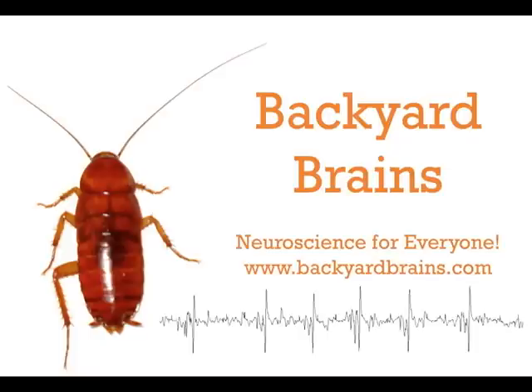Noise — the bane of many a neurophysiologist's existence. Here we go over some common sources of noise related to the spiker box.